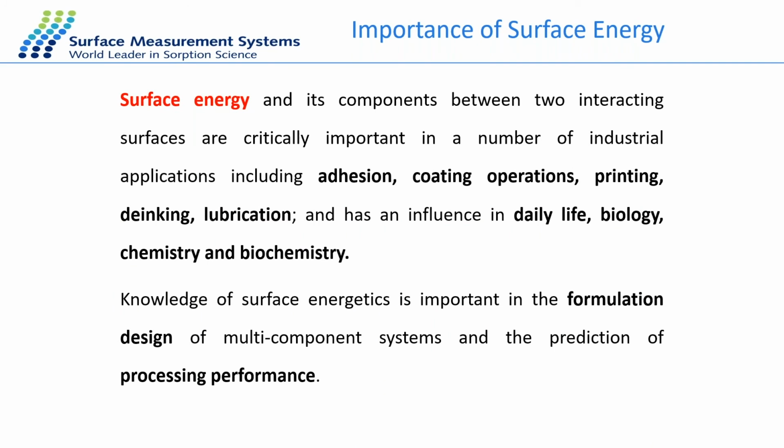Surface energy and its components between two interacting surfaces are critically important in a number of industrial applications, including adhesion, coating operations, printing, and lubrication, and are so important in daily life and biology as well. The knowledge of the surface energetics is important in formulation design of multi-component systems and the prediction of processing performance.